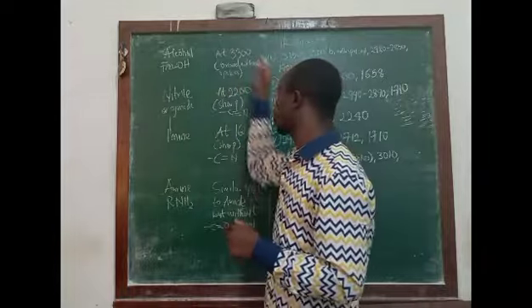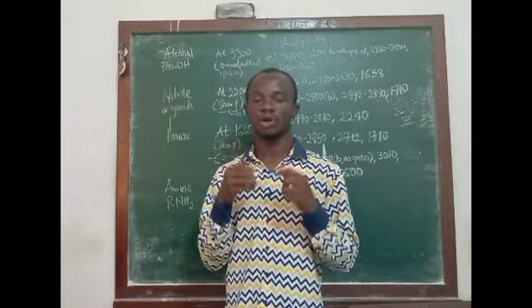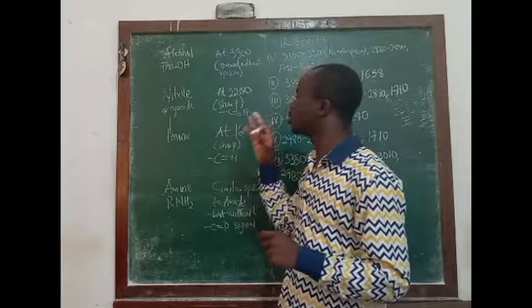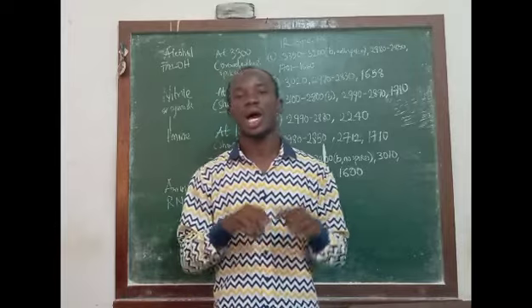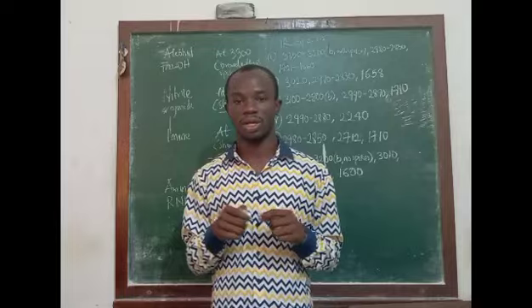And these are other signals that I want to mention that can also be useful in reading your IR spectrum. And the signals I've mentioned in this video and the ones I've mentioned in the previous first and second video are enough for you to be able to read your IR spectra correctly.